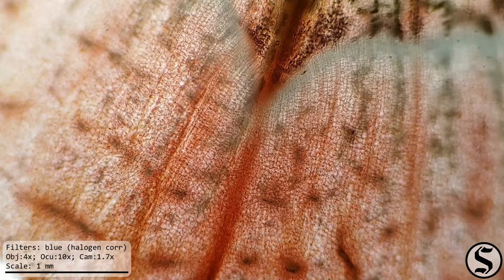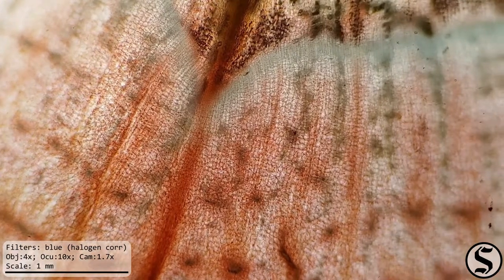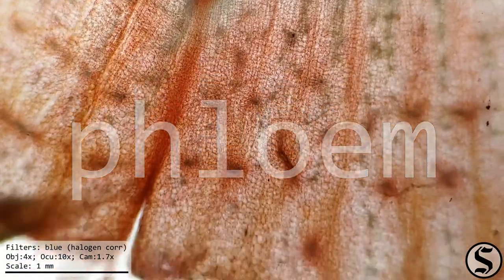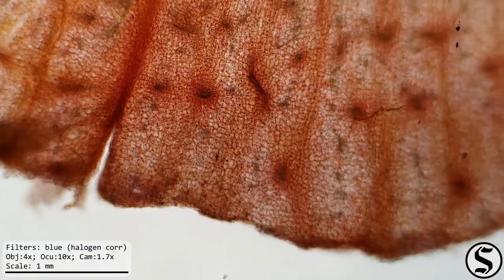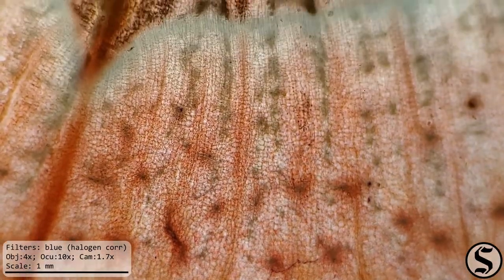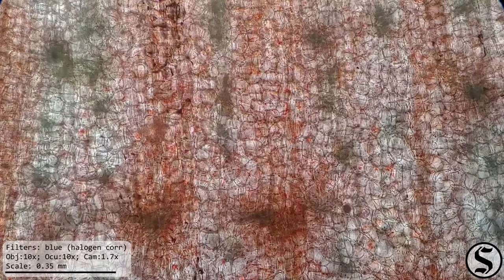Going back out to the outer region, we see the phloem — that's the Greek word for tree bark — and that's what carries the sugars produced up at the leaves down to the root. And as we zoom in, we can see even more of the pigmentation in this region. This is the part of the carrot where most of the color is stored.